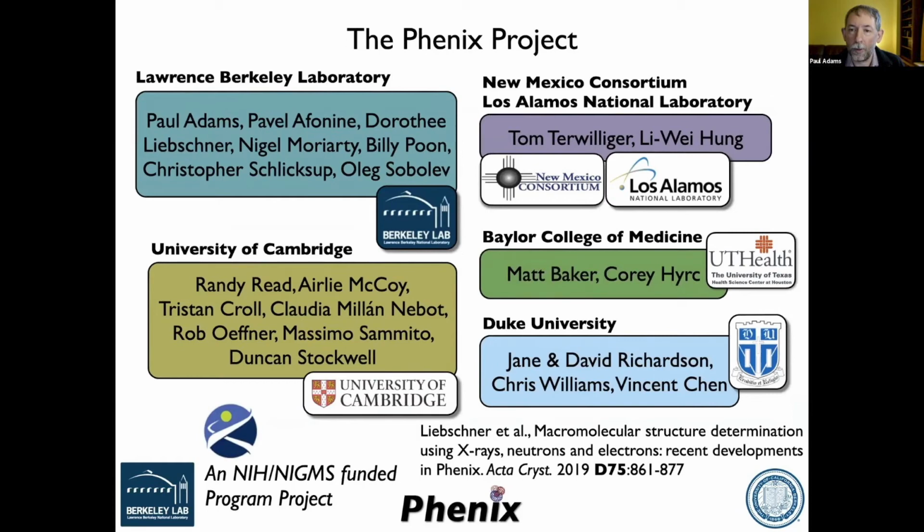So my question is about this model to map FSC curves. Generally in the published papers, I see the model to map FSC is generally higher in value than the map to map FSC. Is there a general reason for that?